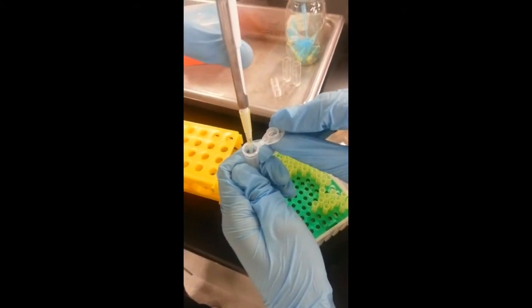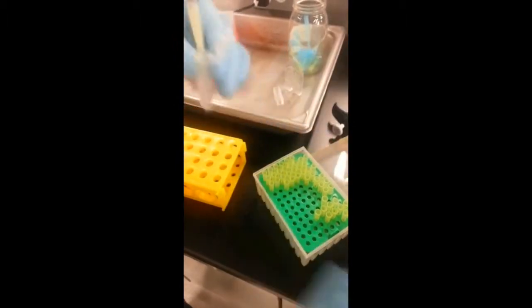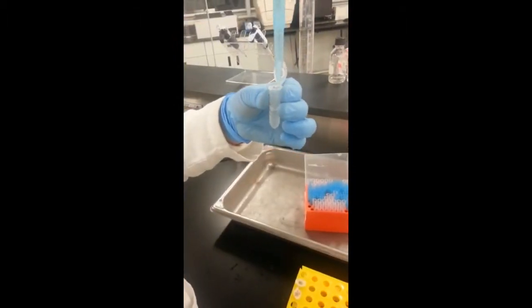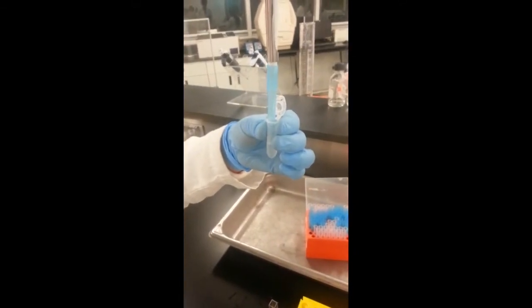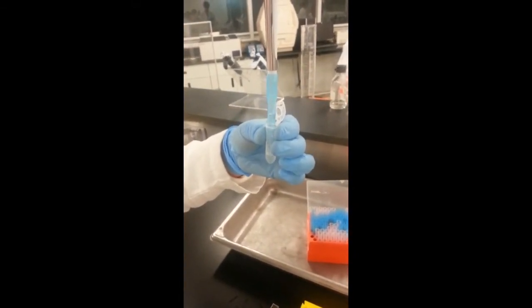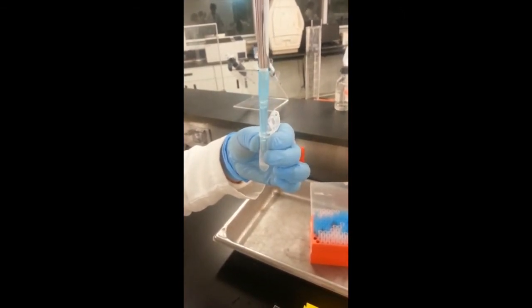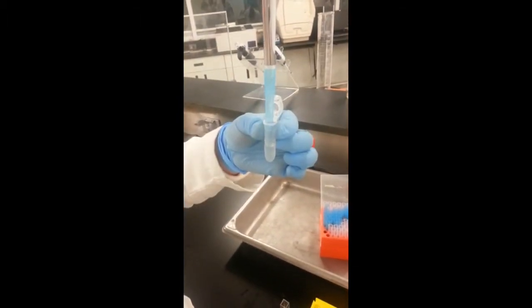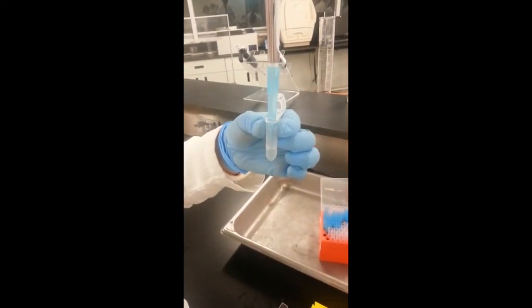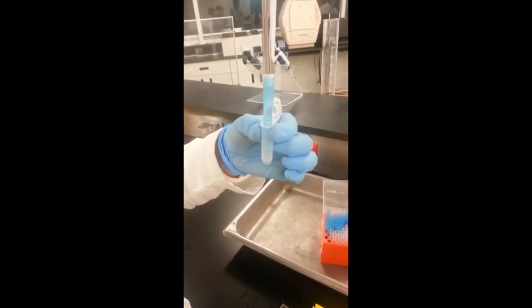Spectrophotometry and electrophoresis are important methods to analyze purified DNA because usually the A260/A280 index does not show the exact purity of the samples, but electrophoresis does. Electrophoresis is a good way to reaffirm the purity of a sample as the quality is clearly shown. The critical step of the purification of DNA is the exposure to UV light when cutting the band of interest from the gel.